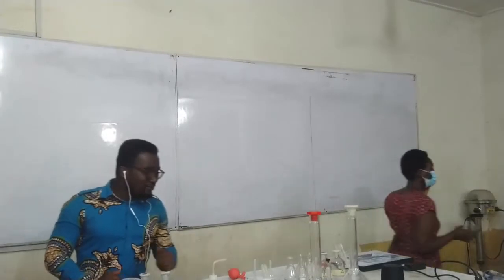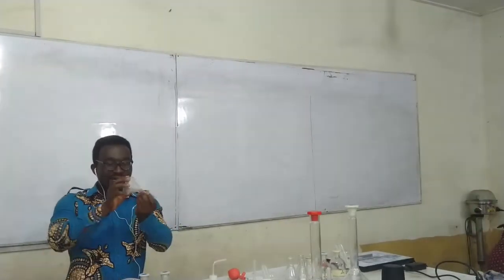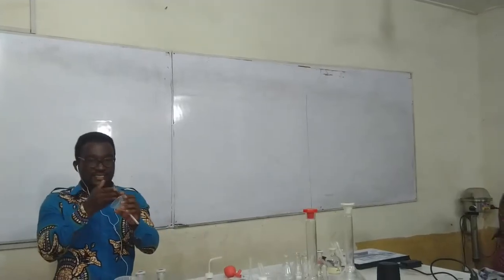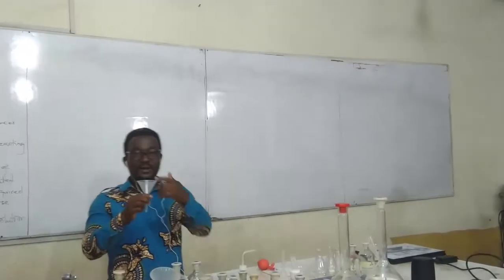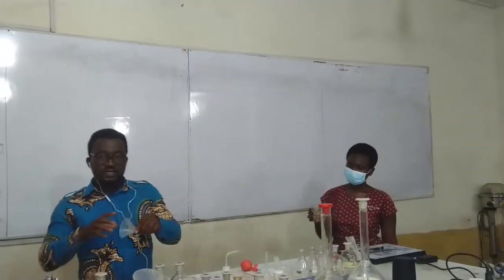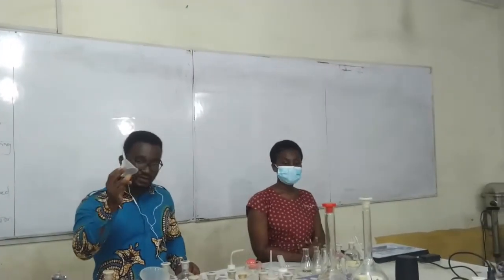Now, specifically, we call these ones filter funnels because, looking at how narrow they are, the filter paper fits in this one very well. So we mostly put the filter paper in here if you want to go through any form of filtration. Generally, it is a funnel, but specifically, it is a filter funnel.